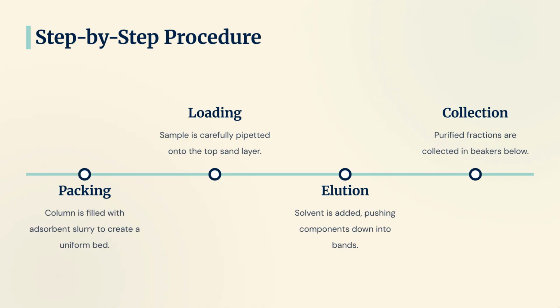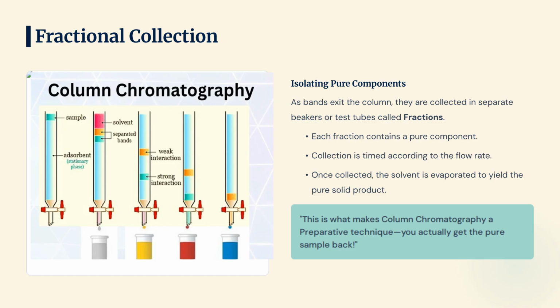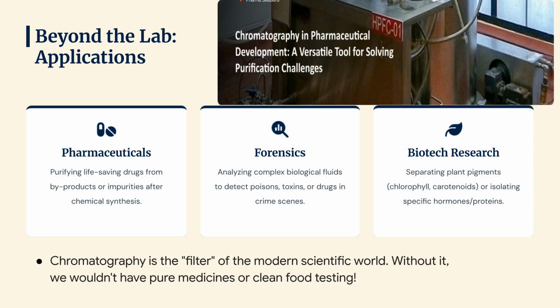And finally, we collect. As each pure separated band reaches the bottom, we collect it into a fresh beaker, giving us pure samples of individual components called fractions. After collection, the solvent is evaporated to yield the pure solid product.